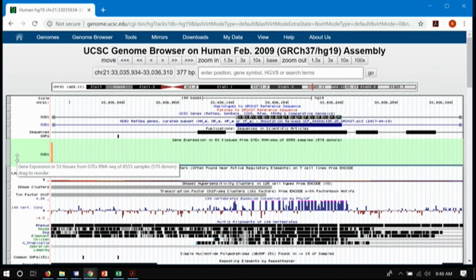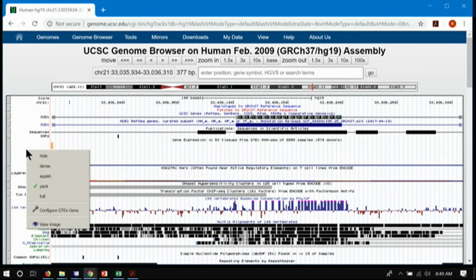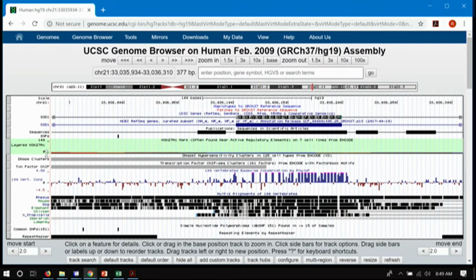You can load them into the browser and see the peaks, or if you have 5 treatments, no treatment, or 0, 1, 2, 5, and 10 micromolar of some drug, you can see how your cell lines are going up or going down with time. You can condense all of the data into a bar chart format like this, and you can load your own data in like that. And so I will use my right mouse button to the left side of the track here and hide that particular data track, and draw your attention back to the gene track here at the top.